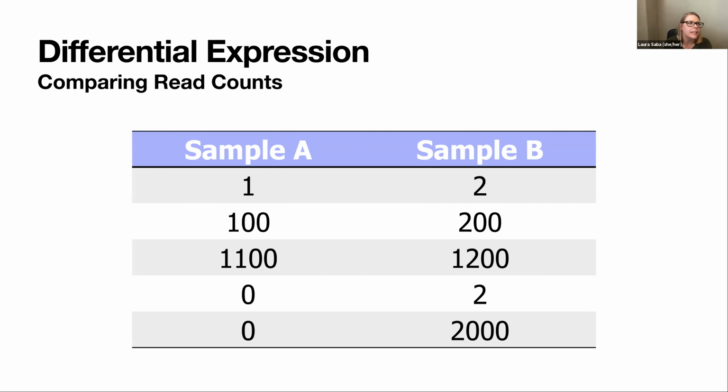So I think that's a good question. Hypothetically, it is still available. Some of the issue with these latent factor analyses is you don't want to adjust for your factor of interest, right? And so you need to tell the model, don't eliminate effects due to strain, don't eliminate effects due to genotype. So you would have to put that quantitative value into the RUV model.